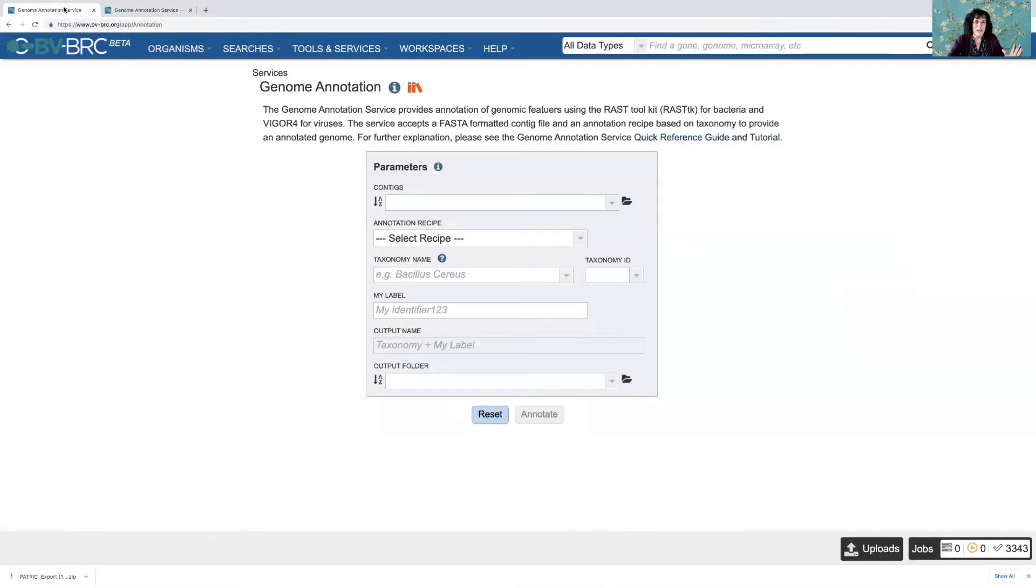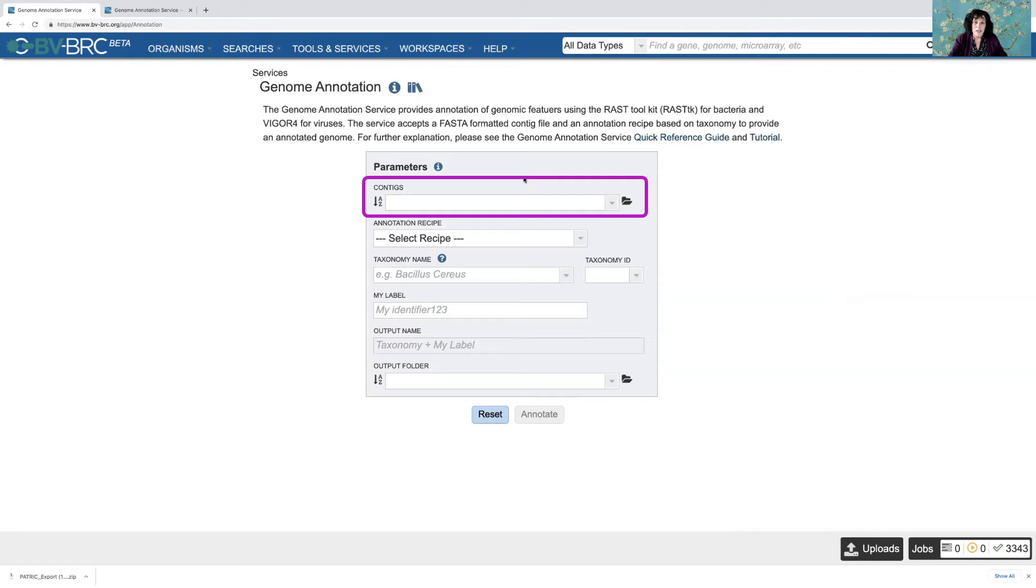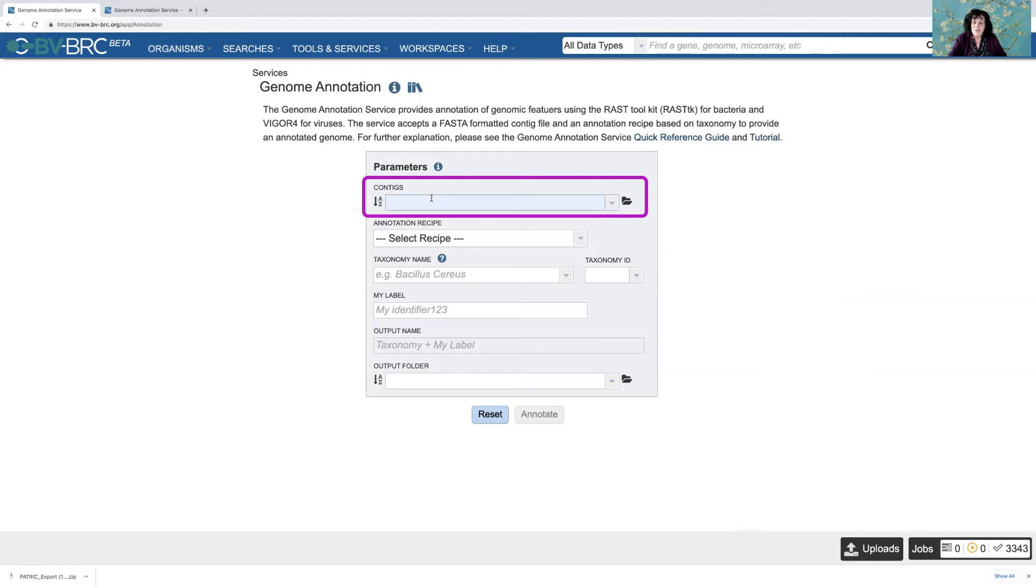But let's go back to submitting a job. Now for annotation, you need contigs. If you did an assembly in BVBRC or PATRIC, that will be somewhere in your workspace. If you did it outside, you can still annotate your data. We don't demand that you use our pipelines for everything.